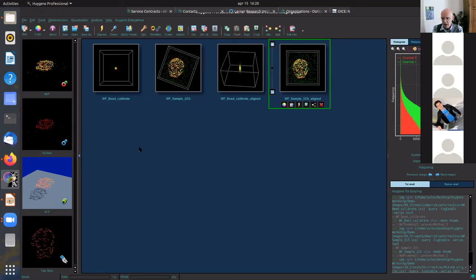In almost any image there is chromatic aberration, and the question is, how much do you want to correct that before doing any type of analysis? It would be good to just run them through the chromatic aberration corrector, see if you have a misalignment, and fix that.